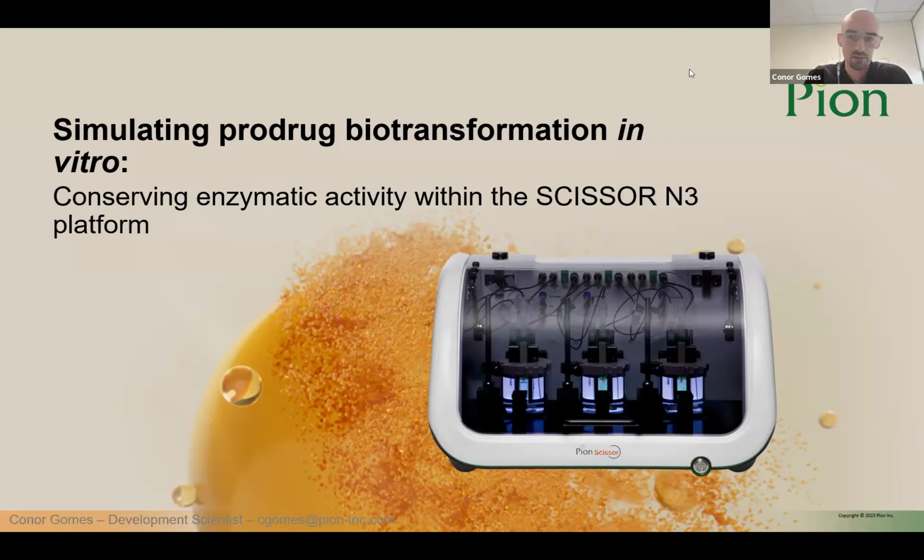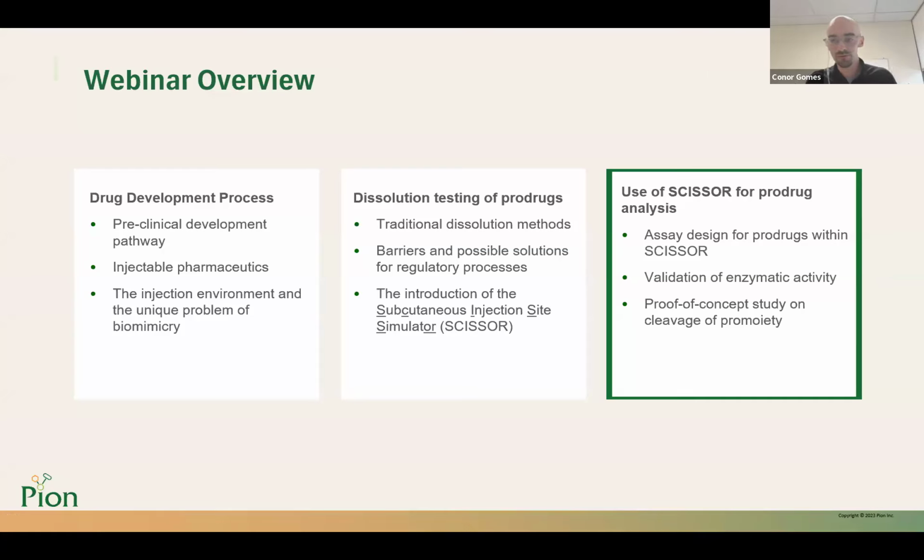Just to give a brief overview of what we're going to be covering today. I think most people won't need a whole review on the drug development process in this webinar, but I'll briefly touch on the points that I want to highlight before continuing on to injectables and then the prodrug environment and the unique problems found using traditional dissolution methods to analyze prodrugs. Through that, we'll then introduce the SCISSOR platform, how we're able to overcome those barriers, and then we'll get into the actual use case of the system in a case study that we went through at Pion.